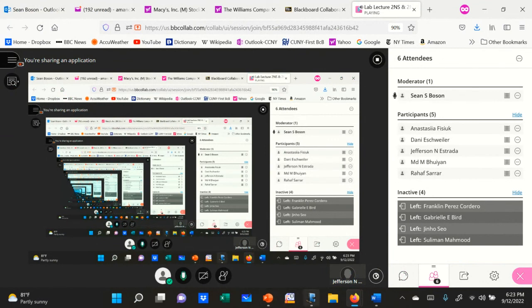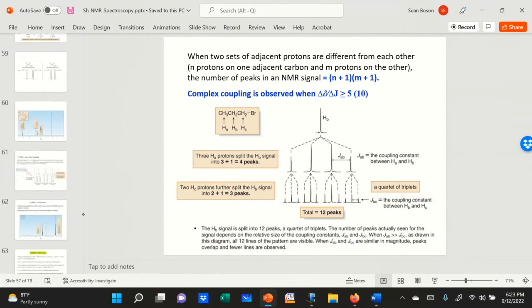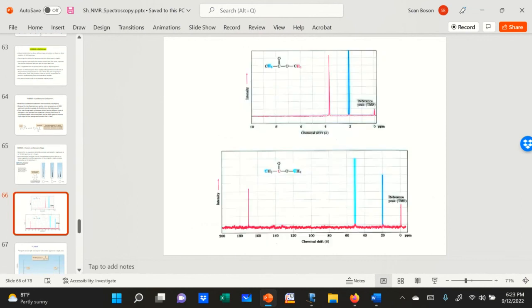The very last thing, I'll take only 1 more minute to indicate that carbon 13 NMR is also in your discussion. Carbon 13 NMR refers to carbon only, very simple to discuss in 1 minute, because, for example, a molecule like this has 2 types of protons, but it has 3 types of carbons.